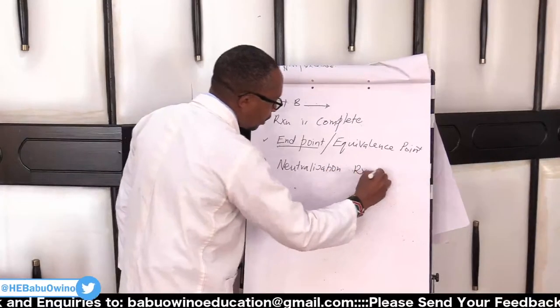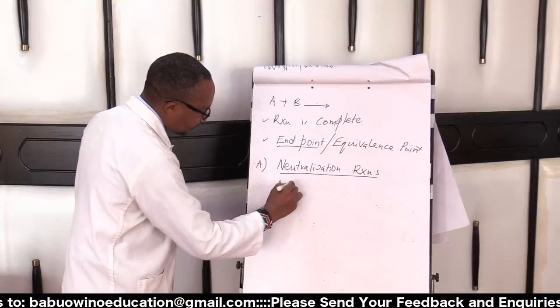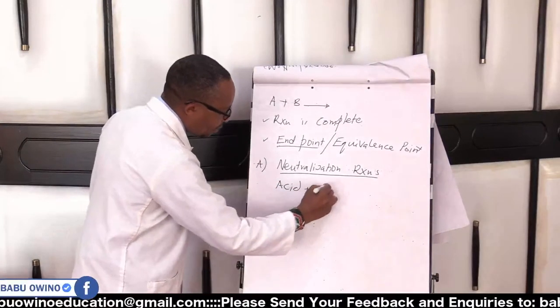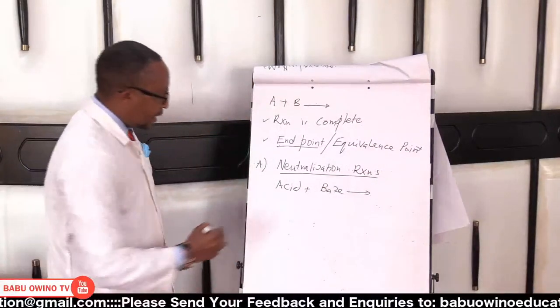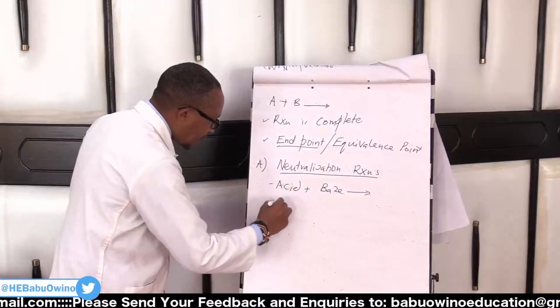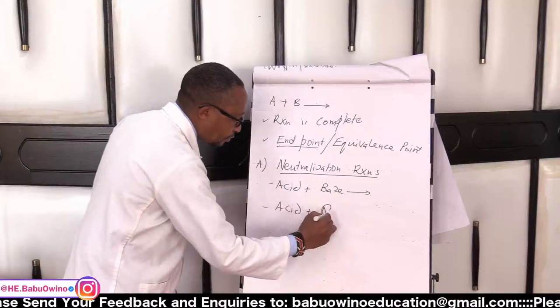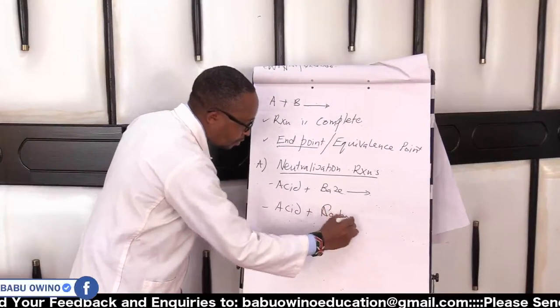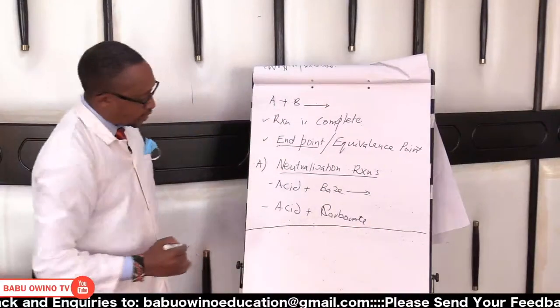Reactions. We are going to take an acid, we combine it with a base to give us a salt and water. Then we will take an acid also, and we take a carbonate. And that is where now we are going to start.